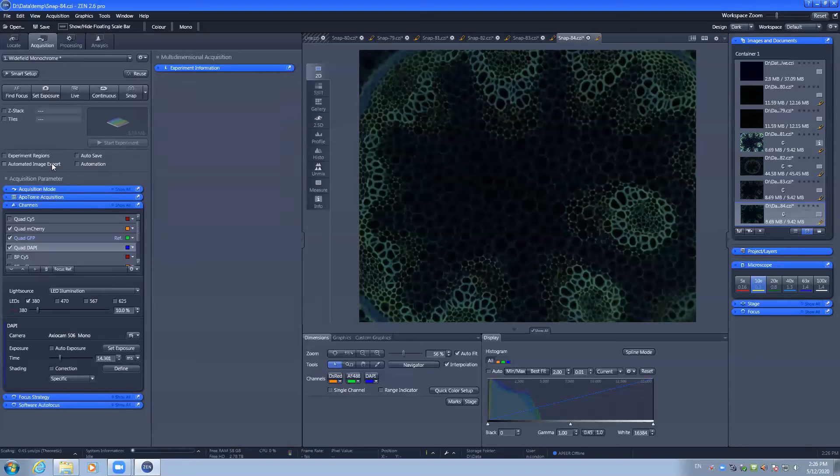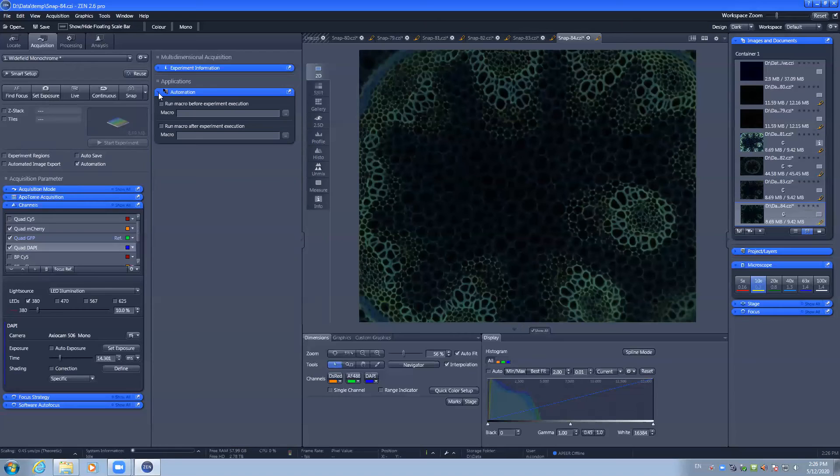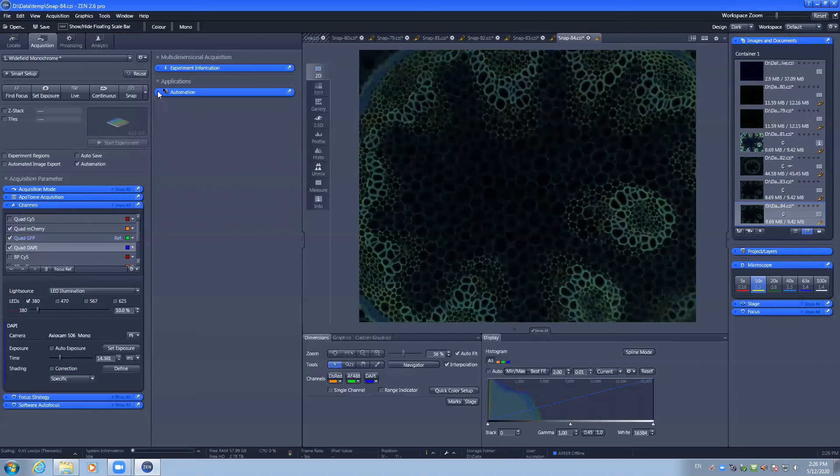There is also experiment regions, which lets you capture smaller areas of the camera chip, and the automation option, which lets you capture images and perform macros either during or after the experiment on the results. Talk to facility staff if that's required.